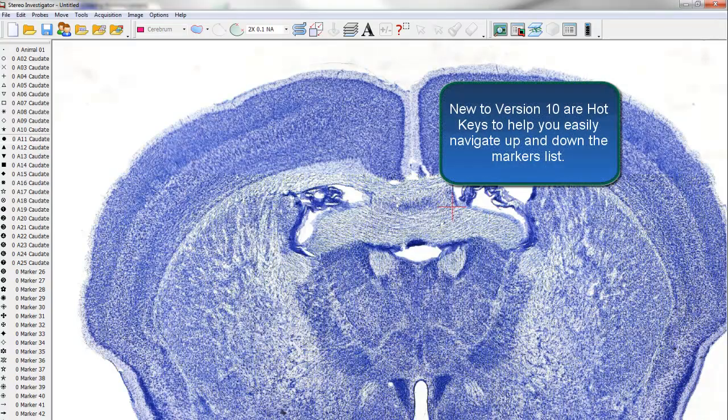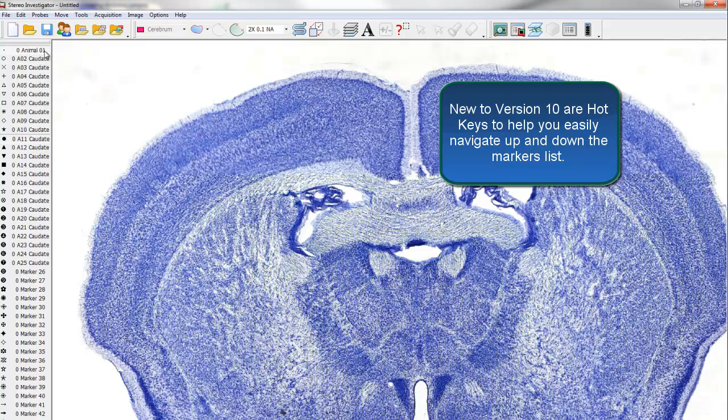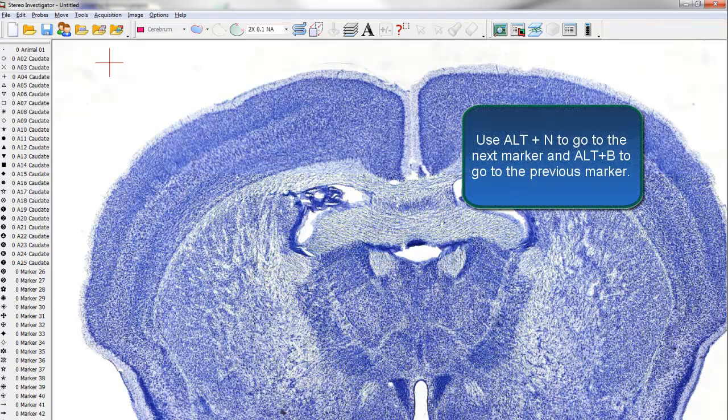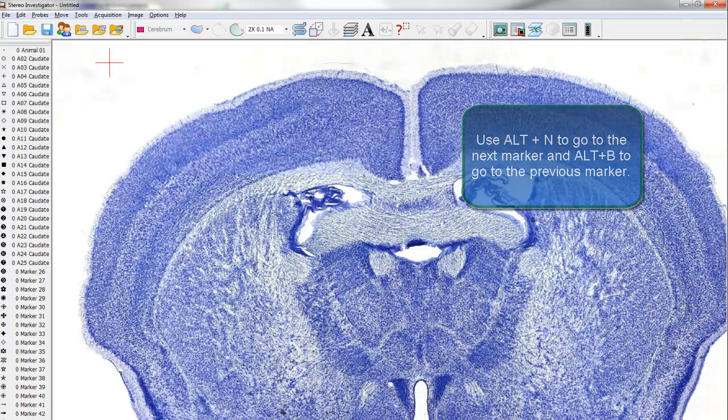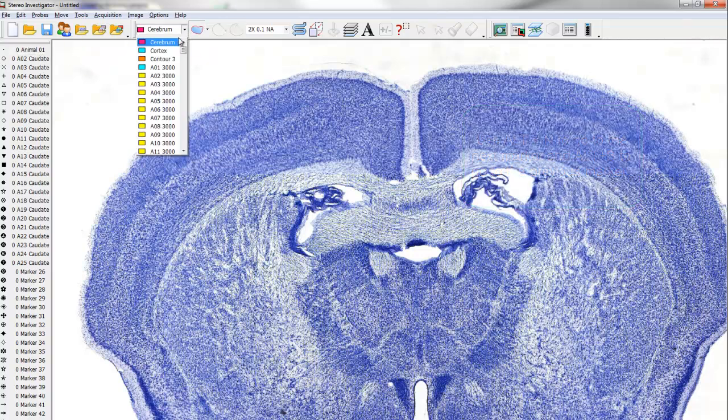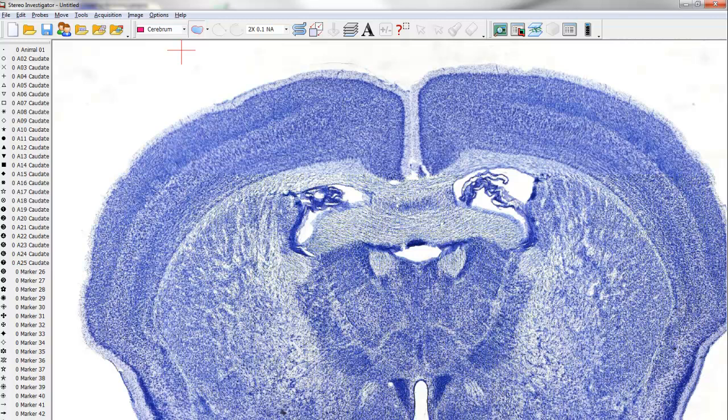Finally, new to version 10 are hotkeys to help you easily navigate up and down the Markers list. Use Alt-N to go to the next marker and Alt-B to go to the previous marker. These same keys work for navigating through the contour list as well. This makes placing markers and tracing contours more convenient and it saves on time.